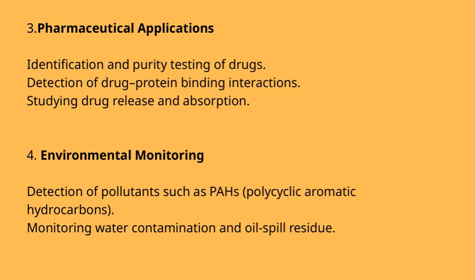Lastly, they are instrumental in studying how drugs are released and absorbed, providing insight into their effectiveness and optimal delivery methods. Moving on to environmental monitoring, these techniques are essential for detecting pollutants like PAHs, or polycyclic aromatic hydrocarbons, which are common environmental contaminants. They also help monitor water contamination and oil spill residues, enabling us to assess environmental health and respond quickly to pollution events. Overall, whether in pharmaceuticals or environmental science, these applications highlight the versatility and importance of our analytical methods in safeguarding health and the environment.